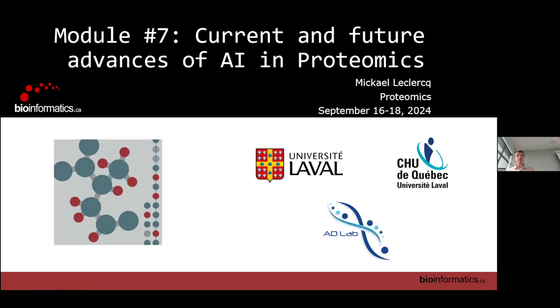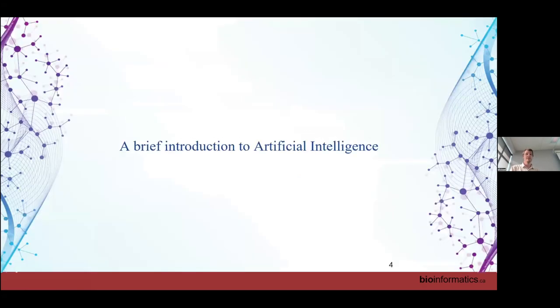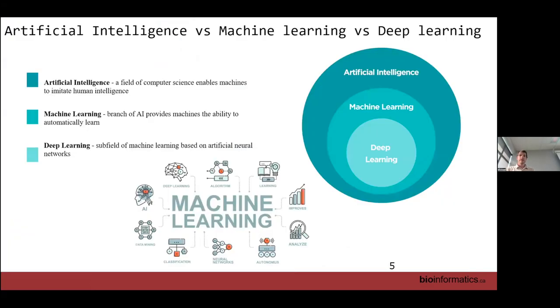I'm going to present you an overview of the current and future advances of AI in proteomics. So by the end of this lecture, I'm going to explain a bit of machine learning, how AI is used in proteomics in general, and maybe the current and the future advances, or the application of AI in proteomics. As maybe not all of you are familiar with the concept of AI, machine learning and deep learning, I'm going to take a few minutes to explain what machine learning is and how it works.